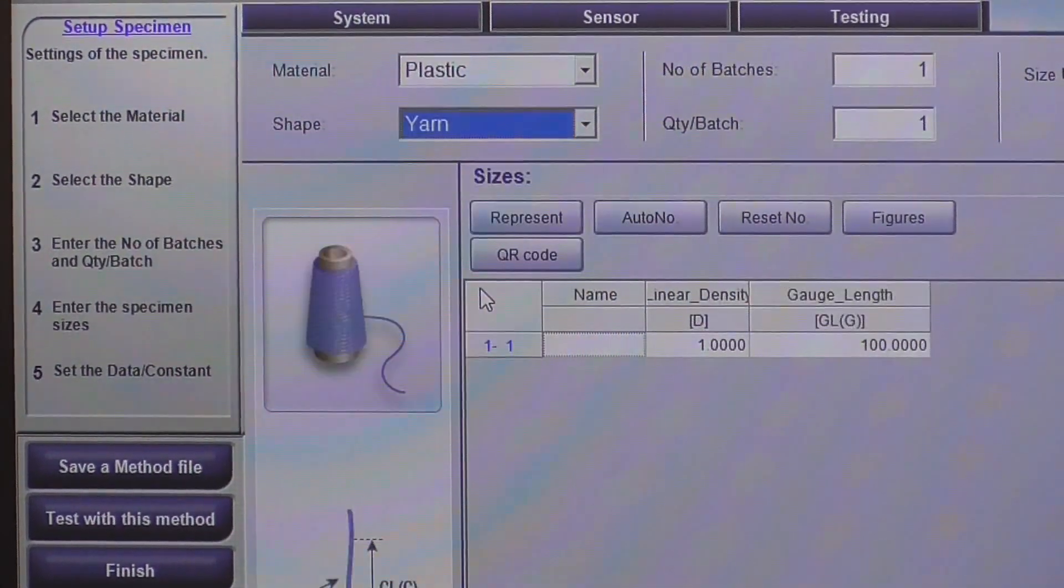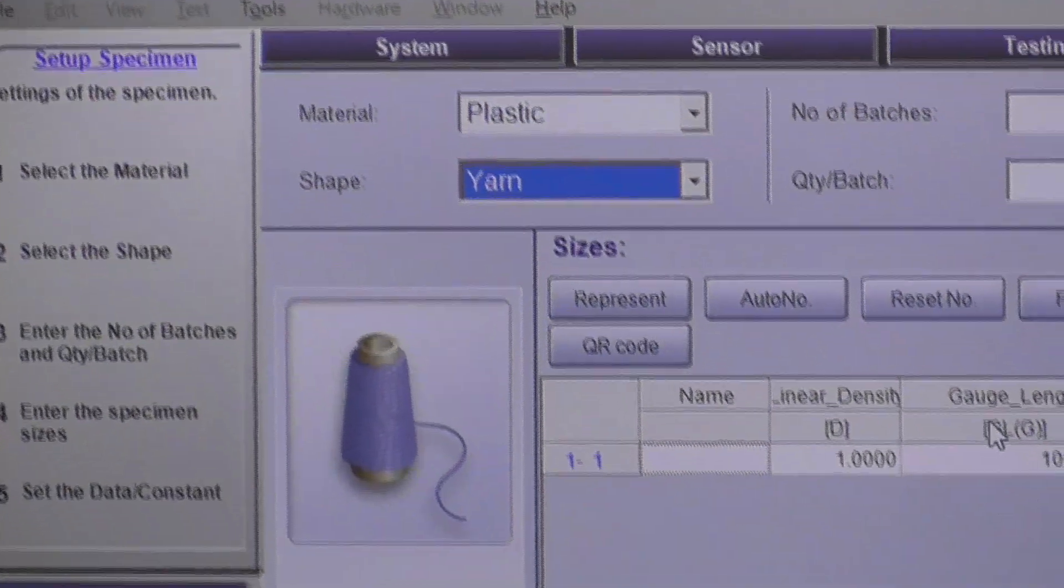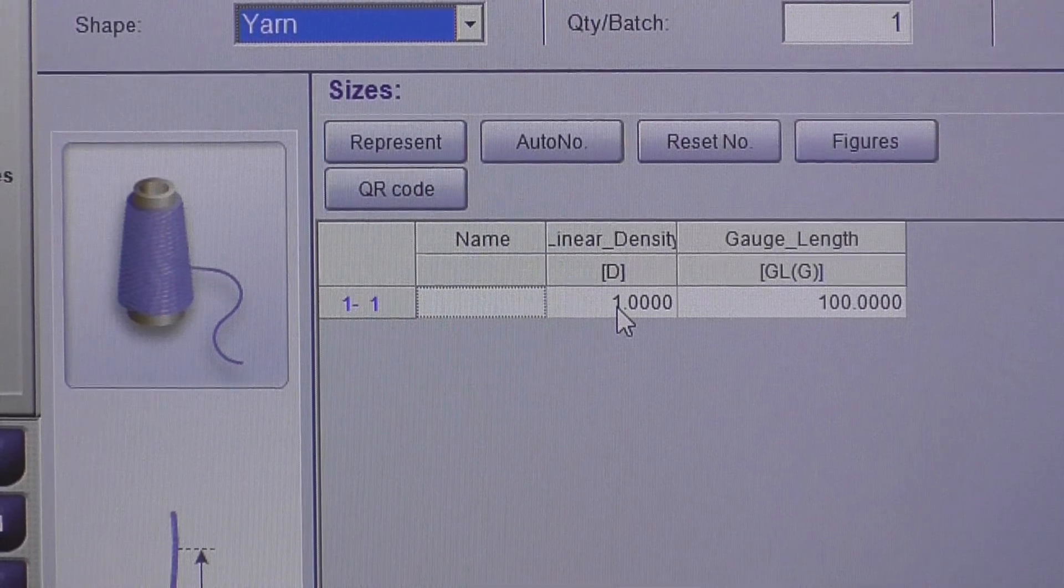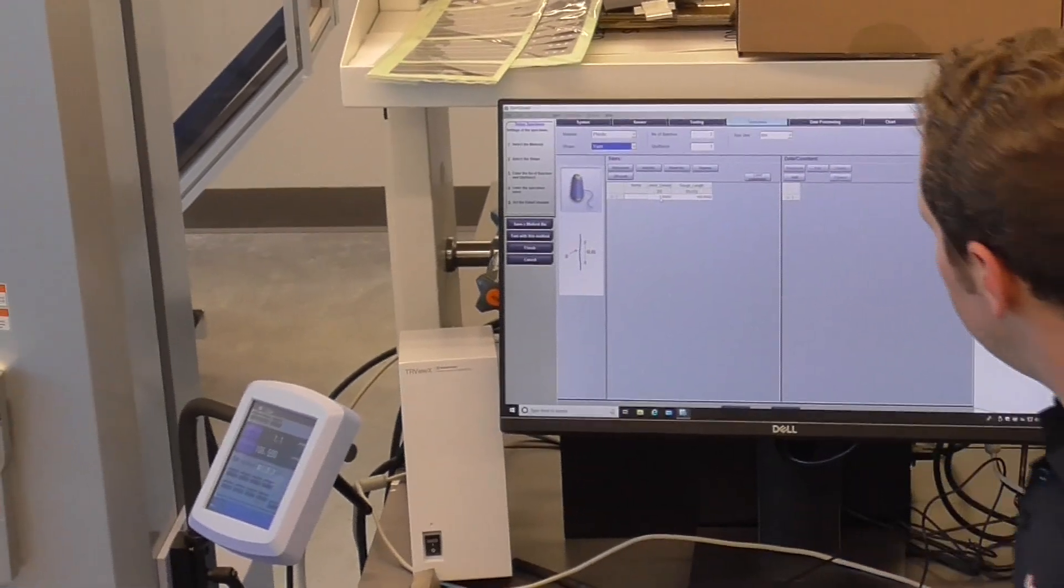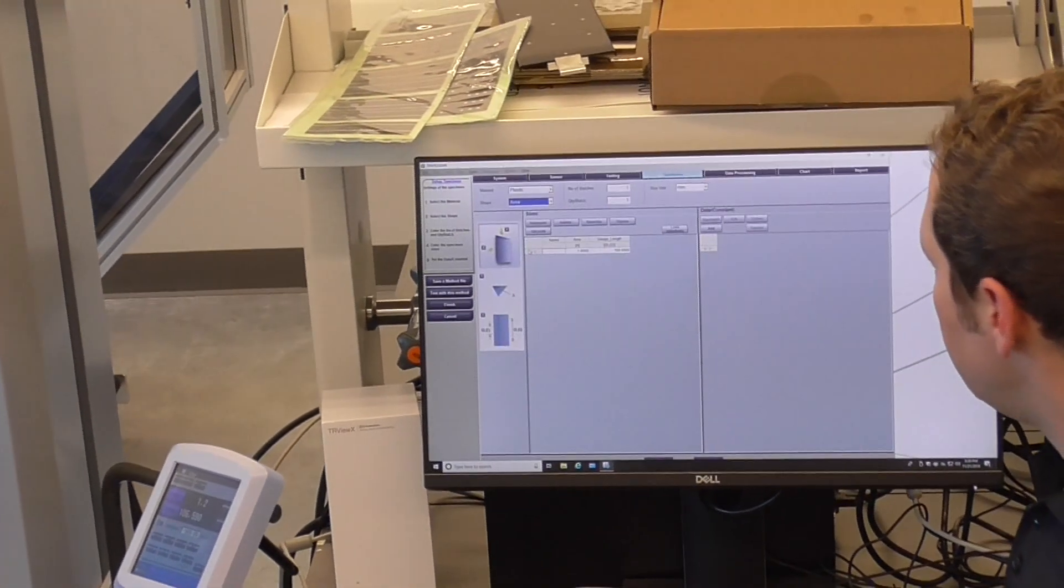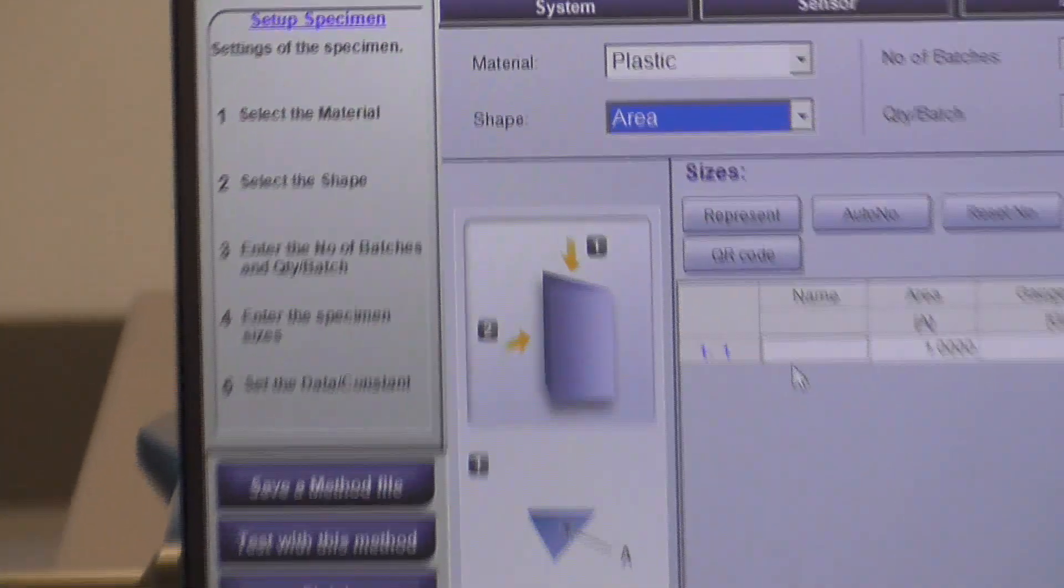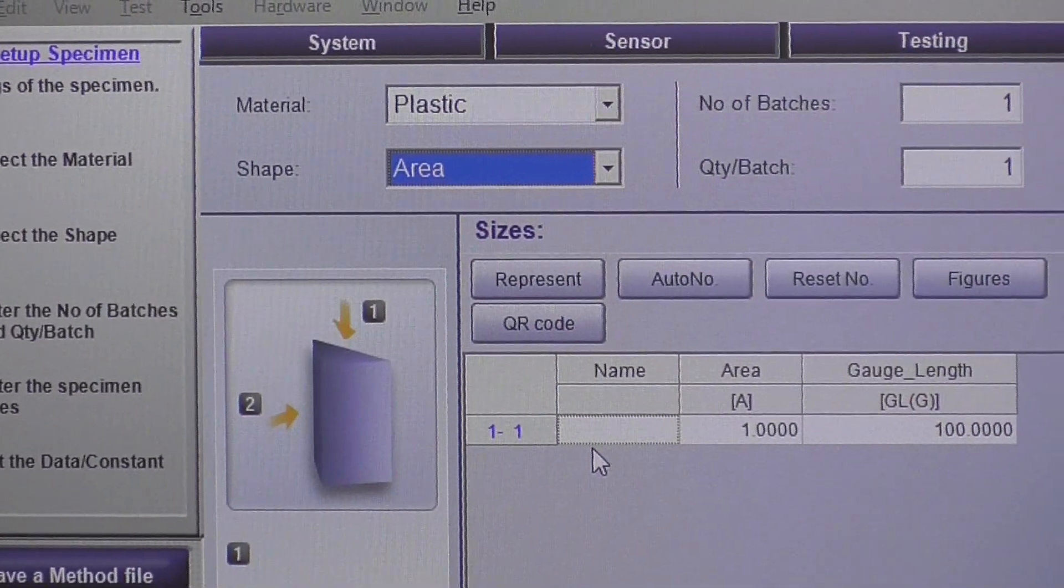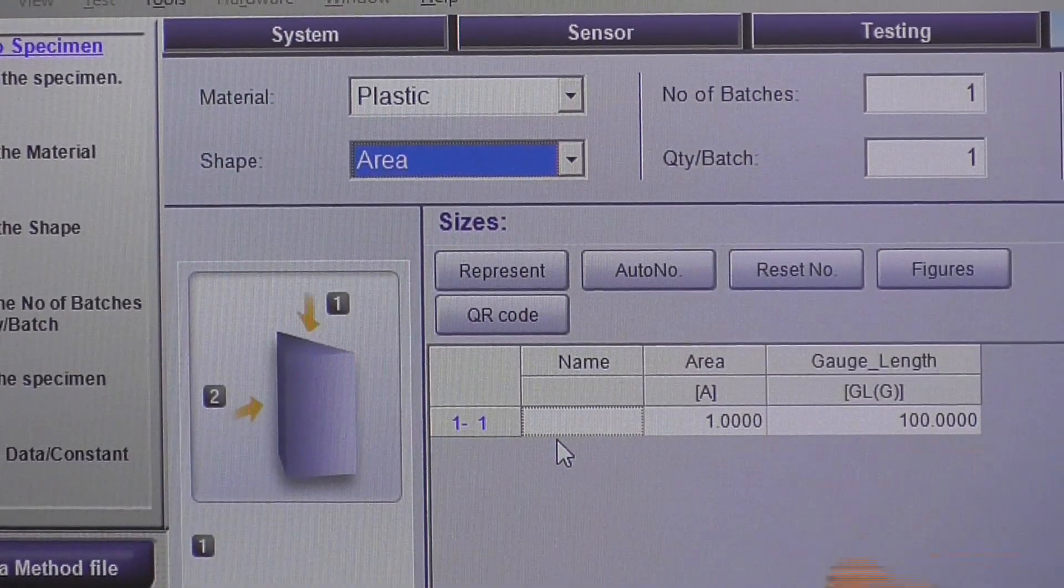And then some also kind of more eccentric things. So yarn, if you're doing fiber testing. This does units of gauge length and also linear density. Lastly, this might come in handy when you're compression testing. If it's kind of an odd-shaped sample that has non-traditional cross-sections that aren't defined here already, you can choose this area. So you can calculate your stress on the sample based off just a cross-sectional area that you can input.